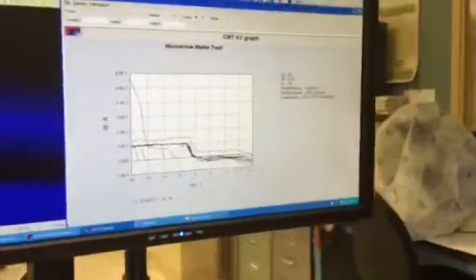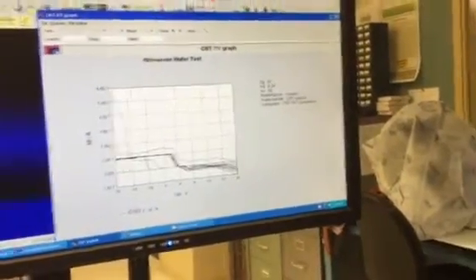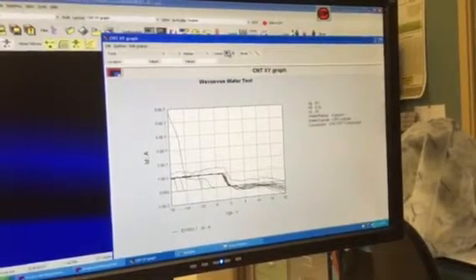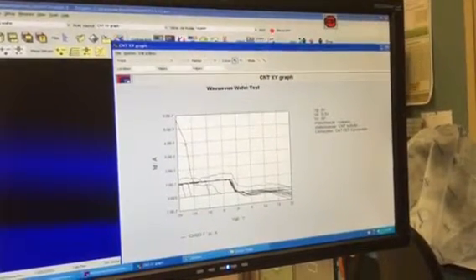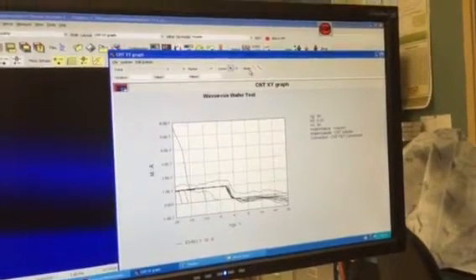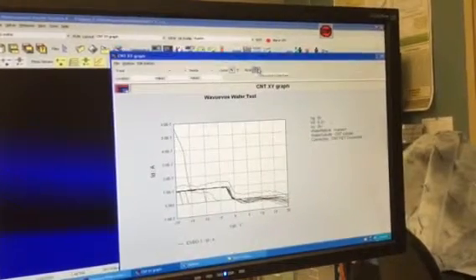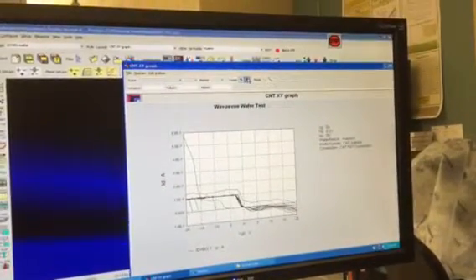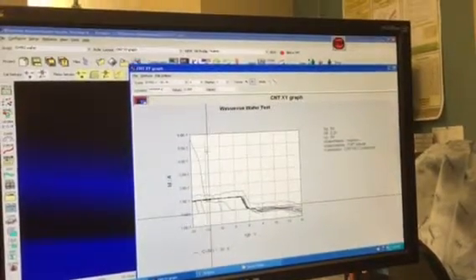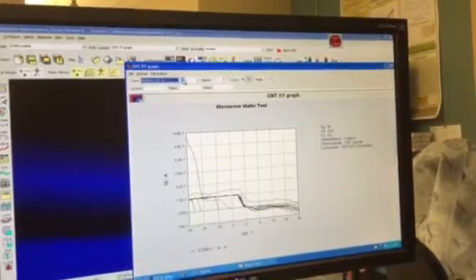Now, should we say which device is this? Yeah, that's my question too. That's the problem. That's the good question. That's what becomes tougher. Let's see. Mode. Let's see. More. Discrete data point, continuous. Turn on crosshair. I thought there was a way. So let's see. That's on one of the curves.